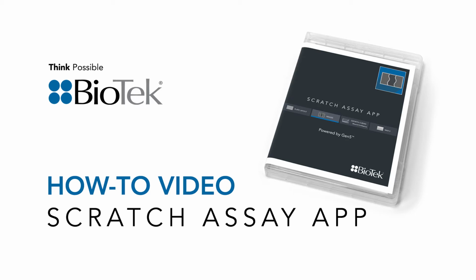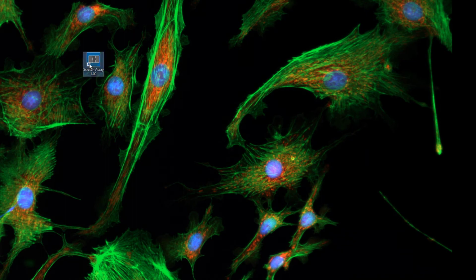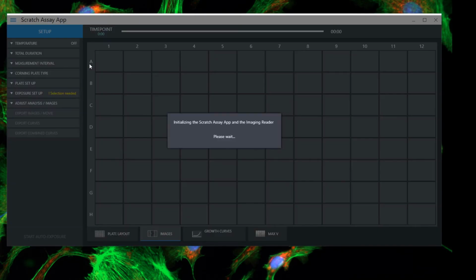Hello, and welcome to BioTek's Scratch Assay application. This app is designed to analyze plates that have been processed using BioTek's AutoScratch wound-making tool. It allows you to automatically collect multiple data points, monitor cell migration over time, and generate quantitative data to characterize the wound healing process. Upon opening the Scratch Assay application, a new blank Scratch Assay template is generated.